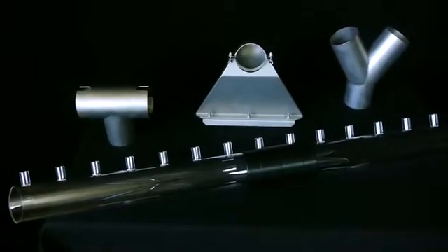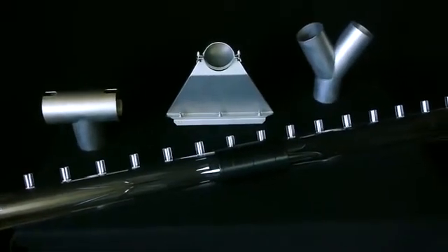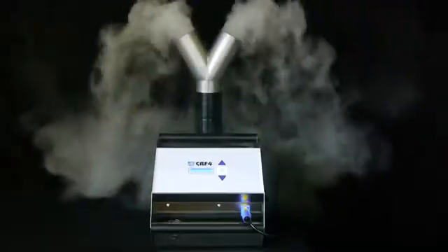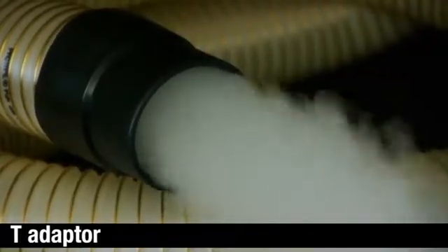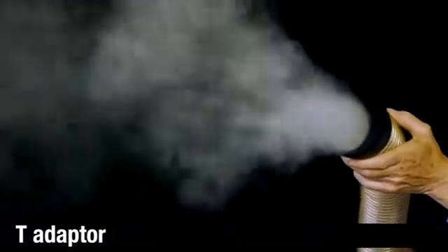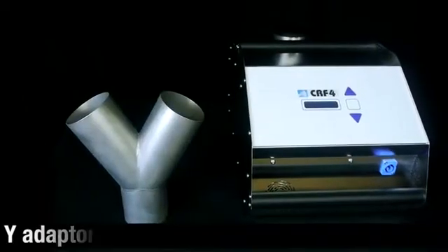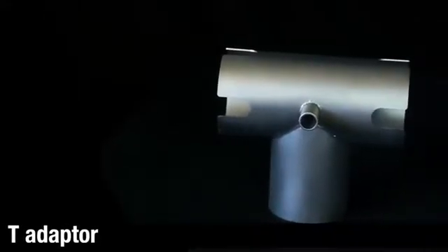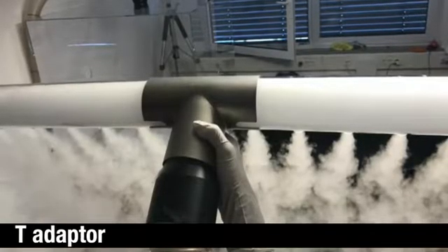Excellent accessories are available to adapt the fog output to your needs. Dense fog exits vertically upwards or through a Y adapter to split the fog output. Connect a T adapter, a single fog hose, or two fog hoses to direct fog into your clean area. The Y adapter provides dual fog output, or connect two 5-meter hoses to the CR4. The T adapter provides dual fog output, or connect two fog wands for a wide fog curtain.